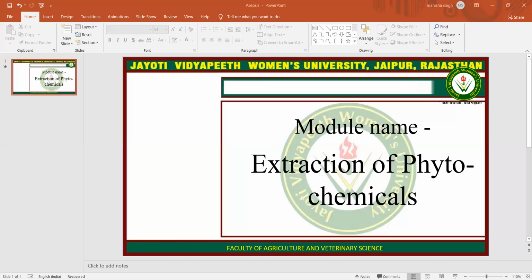Then extraction. For the medicinal plants, we are using cold aqueous percolation, hot aqueous extraction, that is known as decoction, and solvent extraction, that is cold or hot. And for aromatic plants, essential oils, concretes, absolutes, pomades, and resinoids are used.